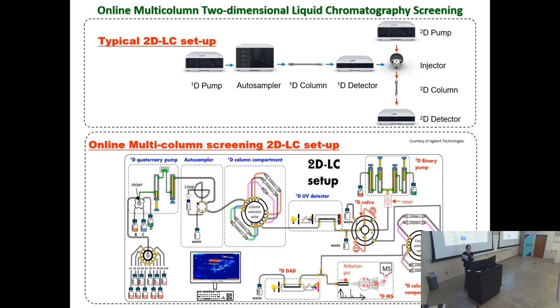One solvent switch valve with 12 lines, to increase the mobile phase selection and improve the first dimension separation, together with the diode array detector on both dimensions and the mass spec on the second dimension. So it allowed us to explore different columns and mobile phases for screening a very complex mixture, in an automatic way, without chromatography purification.